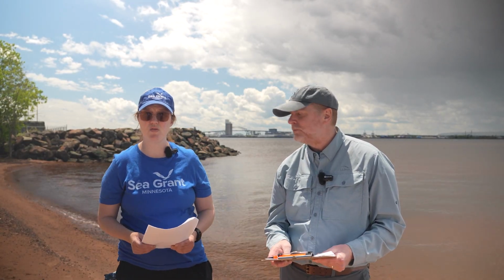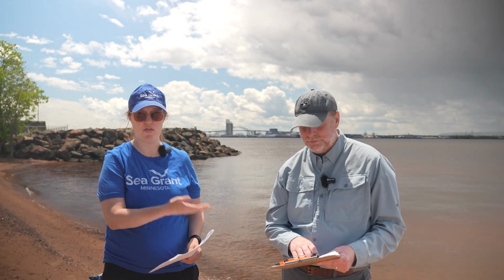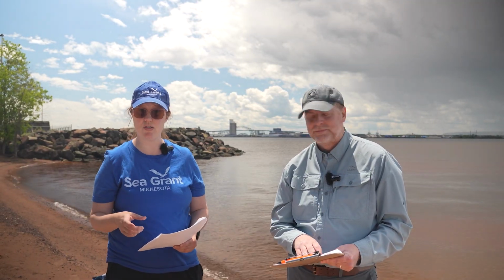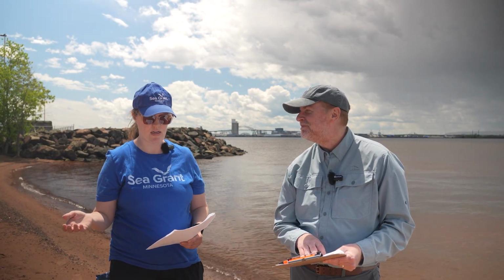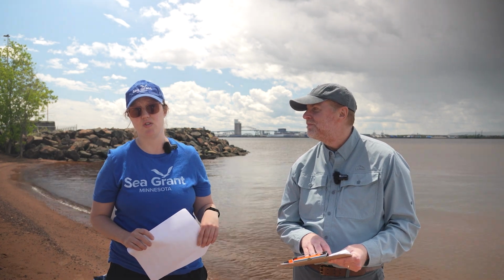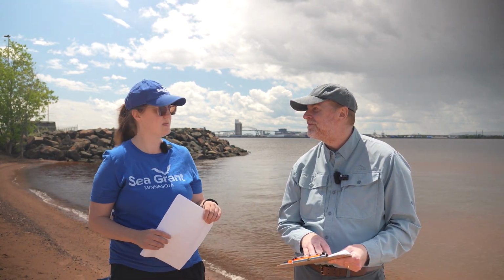The next thing you want to do is make sure you've taken all of your site photos. So other than the photo of your data sheet, make sure you have your 2 site photos and your pocket microscope photo. And then make sure you rinse out your gear, rinse out and dry, and freeze your water sample bottle until it's transferred to project staff or sent back to UMD for further analysis.